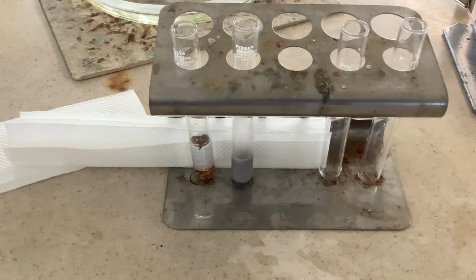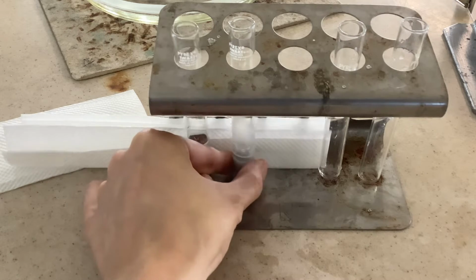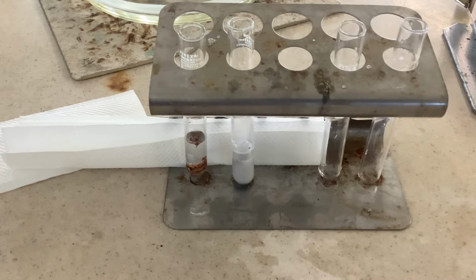So what you can observe is that for copper, there is no observable change, and for the calcium, when it reacts with water, gas bubbles evolve, and you can hear some hissing sound, and then the solution will turn milky or white in color. And if you really touch the test tube wall, you can feel that it becomes warmer. It's because the reaction between calcium and water is an exothermic reaction. It releases heat into the surroundings and heats up the water.